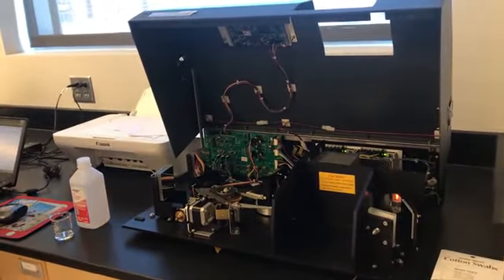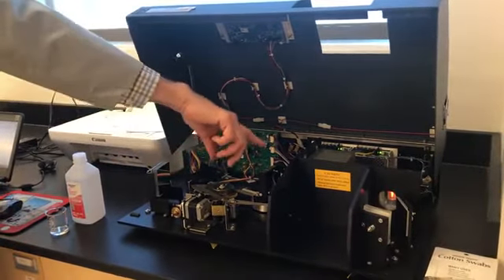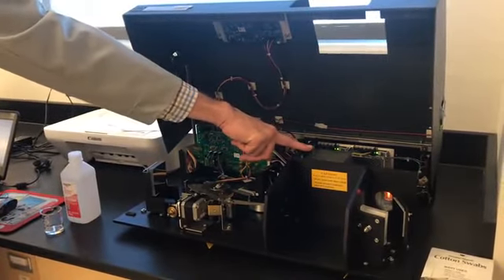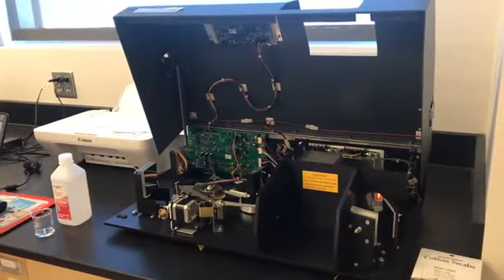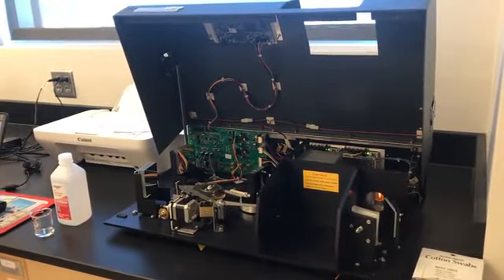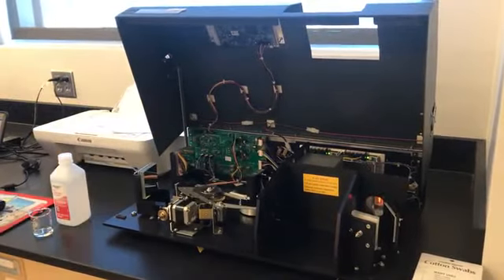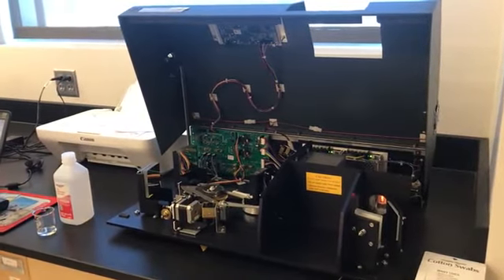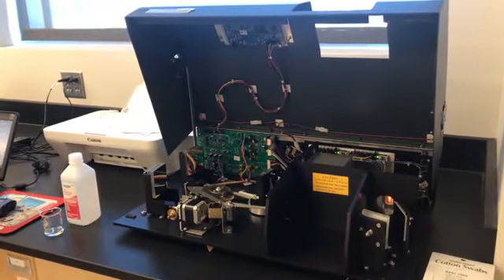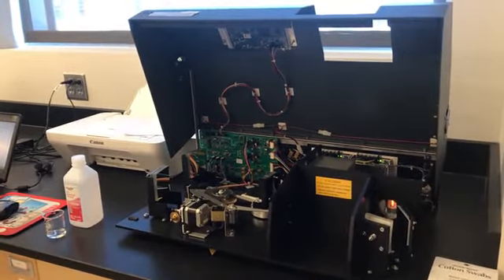The light from the source comes through, it's dispersed, and then individual wavelengths are focused on the detector. This is the detector that measures the intensity of the light after it passes through the sample. The grating here will be rotated, and that's how we select or change the wavelength or wave number of radiation that we're passing through the sample. So again, this is a monochromator-based instrument rather than an FT instrument.